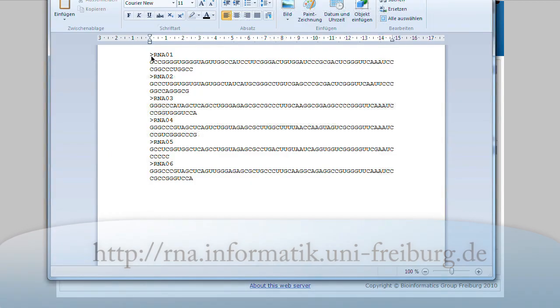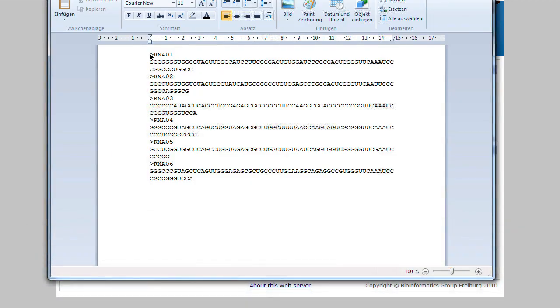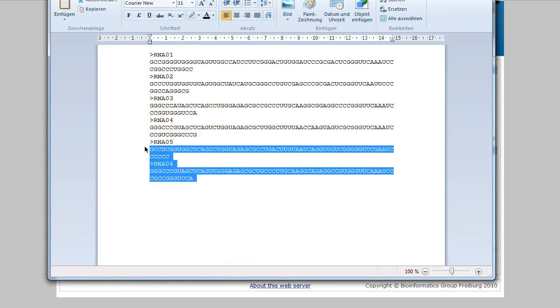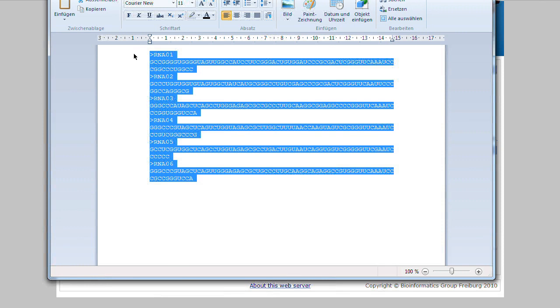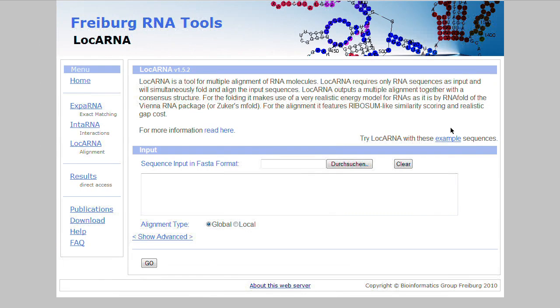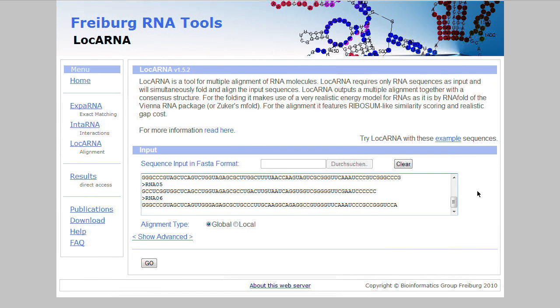I already prepared a bunch of sequences in this text file. By the way, the last two sequences were exactly the two we've seen in the animation in the introduction at the beginning. I now just copy all of them with CTRL-C and paste them into this field.